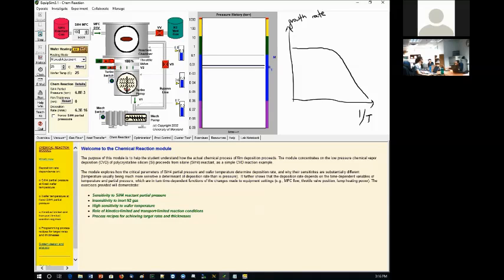Okay, now we are going to switch to 50 degrees. What we're going to do is set to 50. And we're going to observe the deposition rate change or not change. Doesn't really change. What does this mean? The 50 degrees is not enough to facilitate the reaction. Does that make sense? We are not growing any thin film yet. We're not growing any silicon yet.